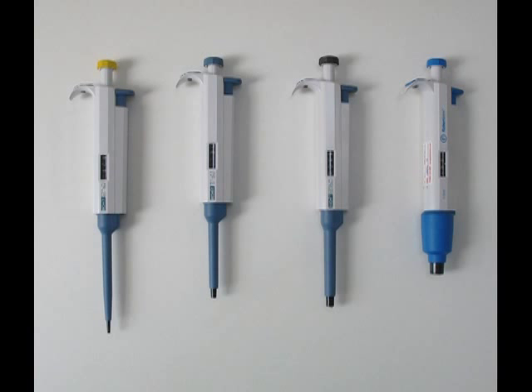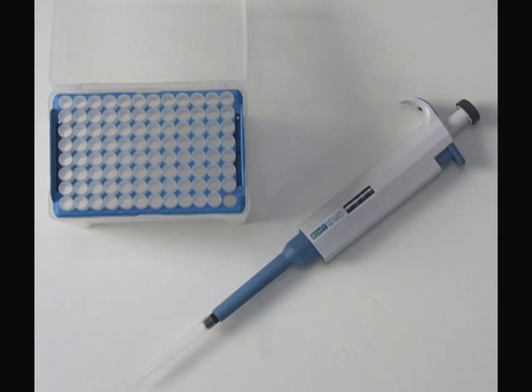The pipette itself should never come into contact with any liquid, so disposable pipette tips are fitted and used to handle the liquid.